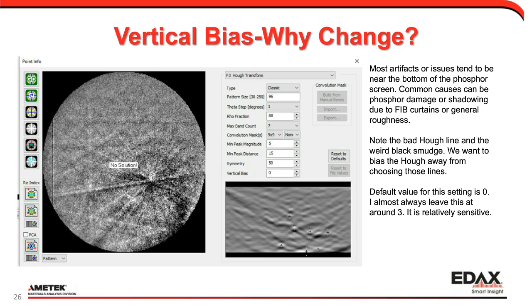So I'm going to have this fit be different. And honestly, fit values should be in the 1.5 range for most materials, 1.5 degrees. If I start getting close to 2, I really need to think about why it's wrong. In that case, it's usually either the phase file is wrong, or maybe my sample's heavily deformed, or of course my calibration could be wrong. If everything is off and my fits are bad, often it can be a calibration problem. That's something to look at, but that's usually pretty easy to fix.